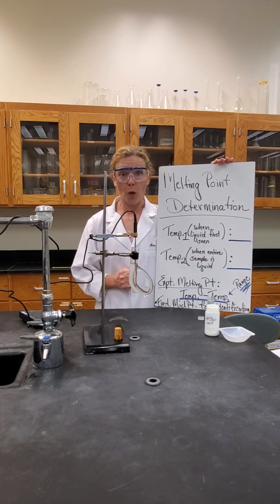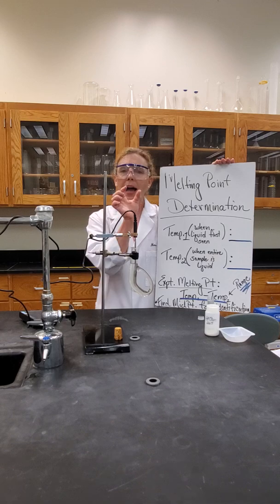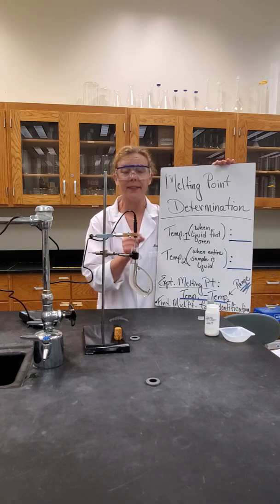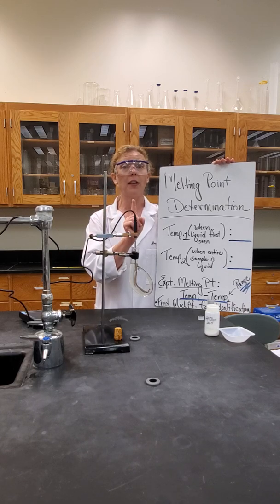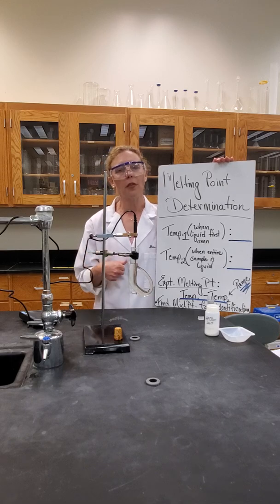It would be wonderful if we could do a minimum of 2 trials, as long as the midpoint of both ranges agrees within 1 degree Celsius. You can keep those 2 trials. If it doesn't, you need to do a third.